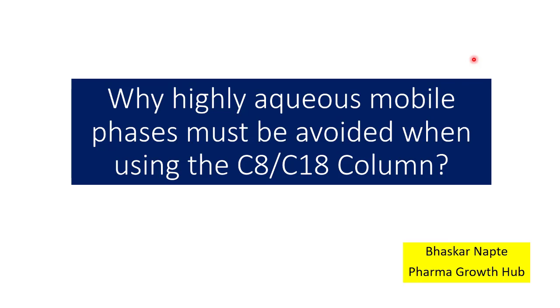In reverse phase chromatography, our stationary phase is non-polar and our mobile phase is polar. To make the mobile phase polar, we add an aqueous component like water. However, there is a limitation on adding water to the mobile phase. You cannot run reverse phase chromatography with very high water content — for example 90%, 95%, or even 100% — without resolving certain challenges first.